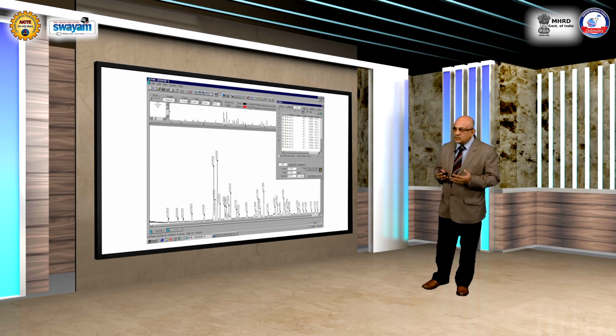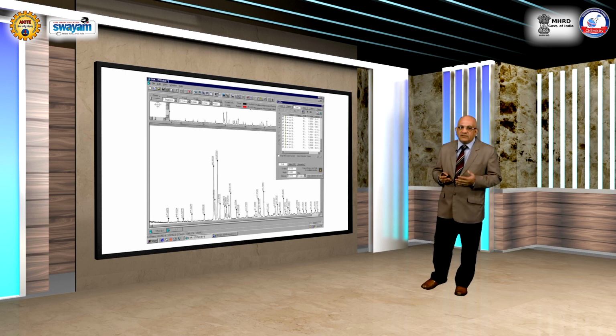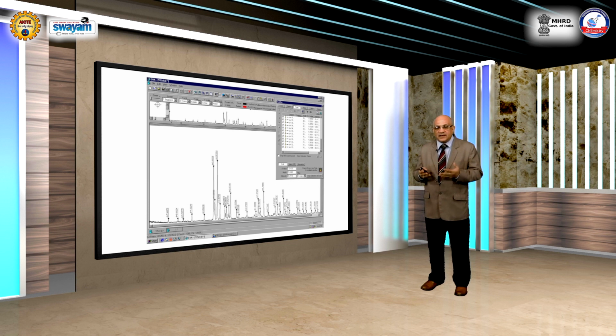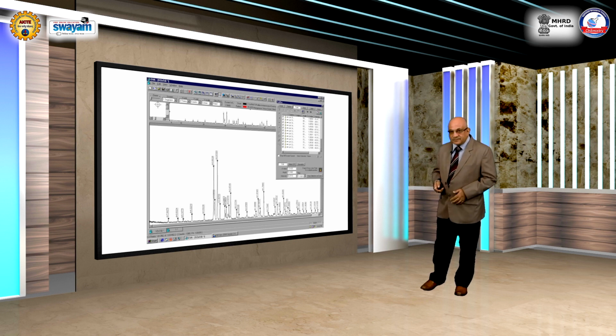That way you can compare the d values of your material which you have studied using the X-ray with the d values of the material recorded earlier and available to you as data to compare and match with the X-ray diffraction pattern.